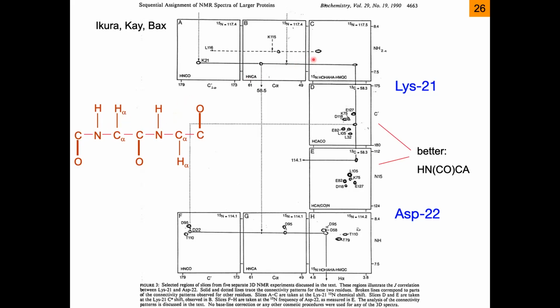So you get the alpha proton frequencies here. It's on this axis, I think. So you connect all of this here, this part.